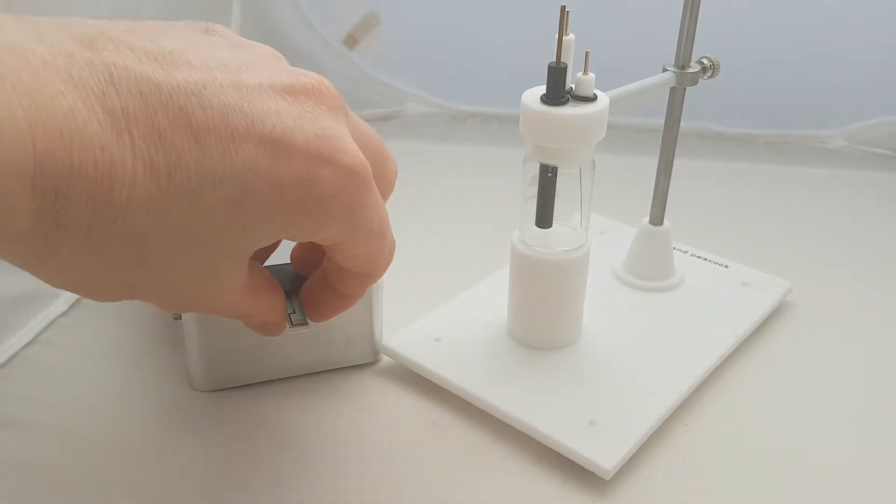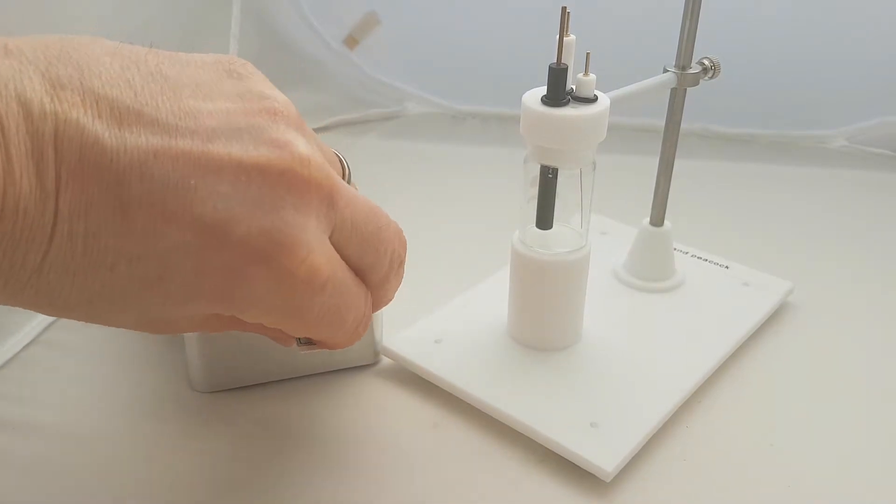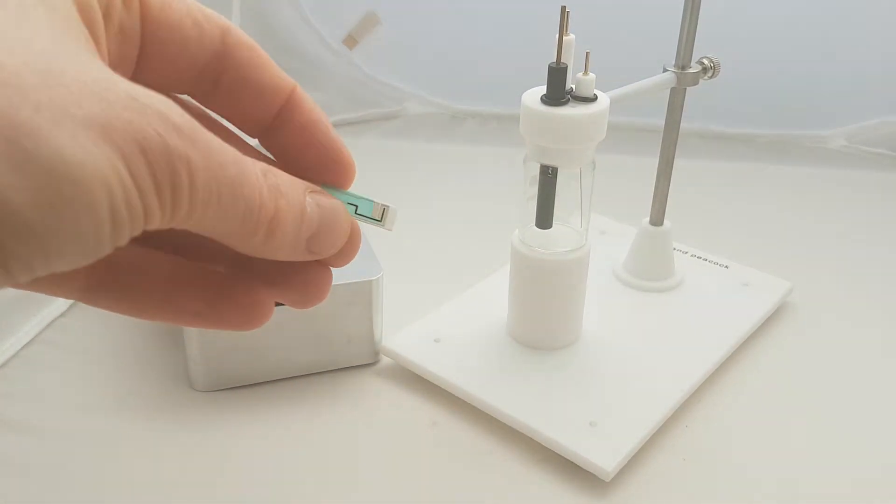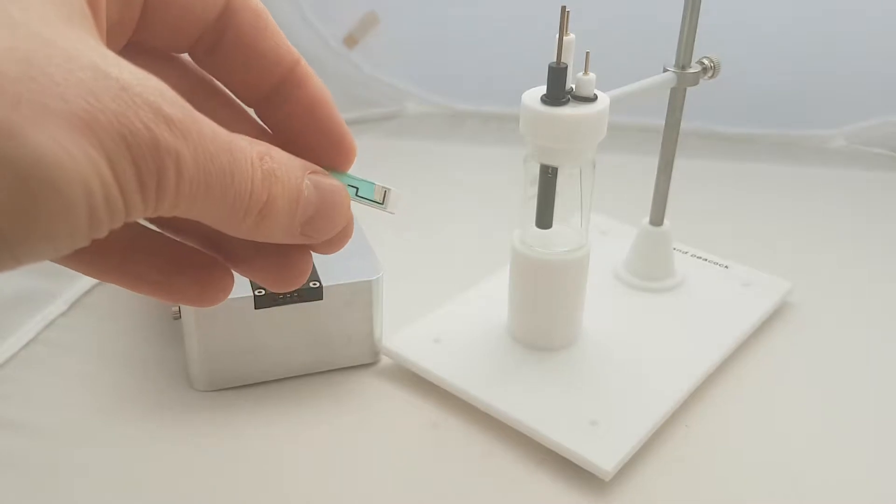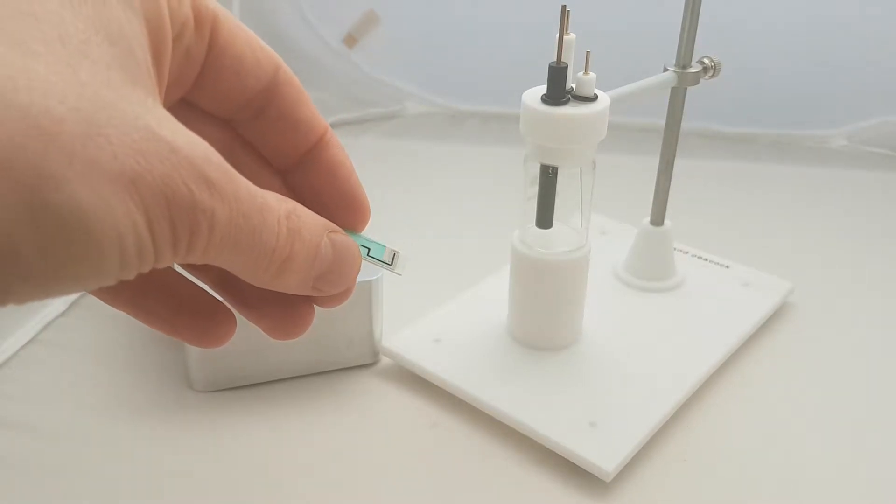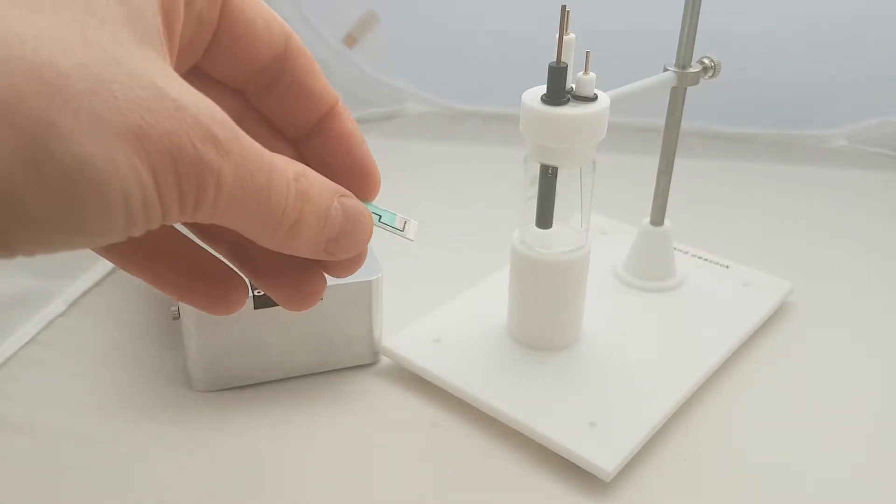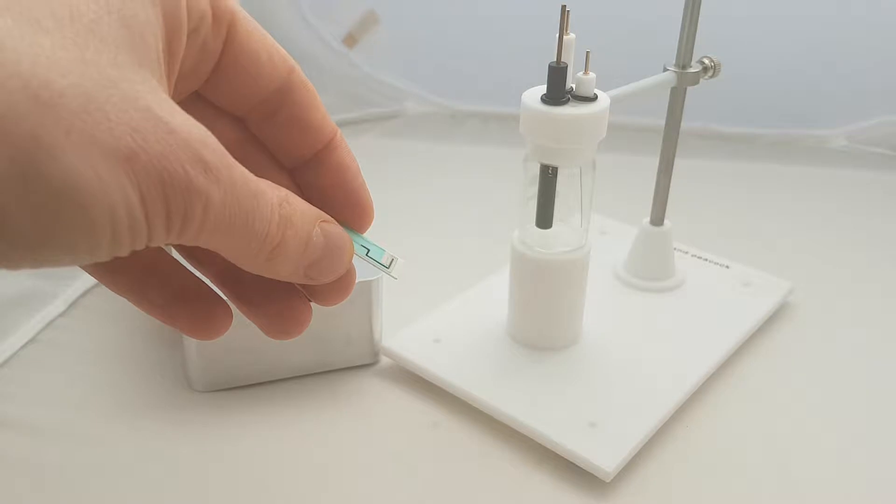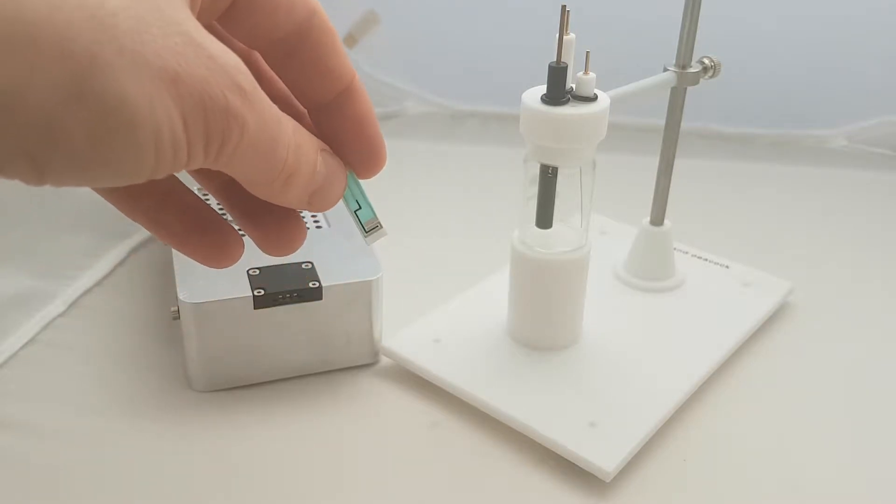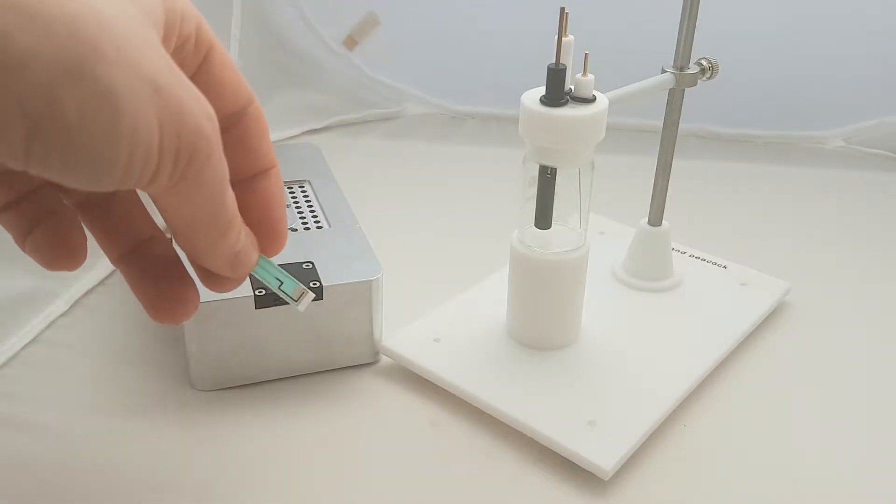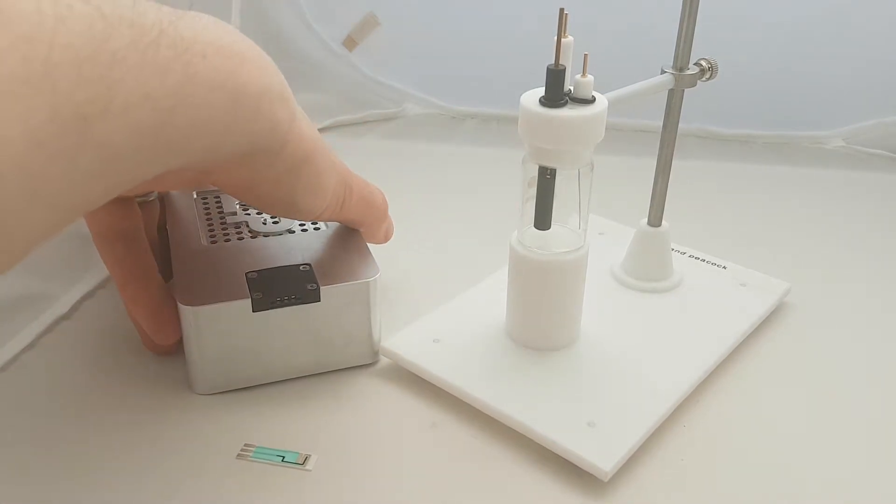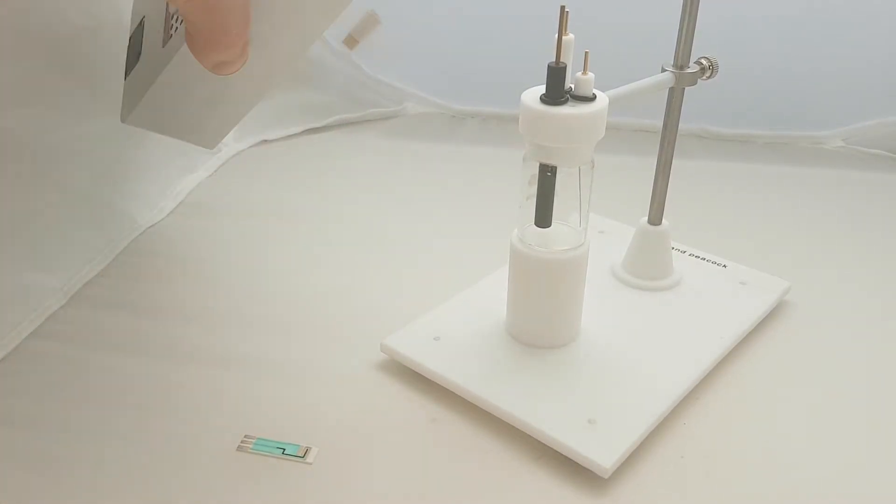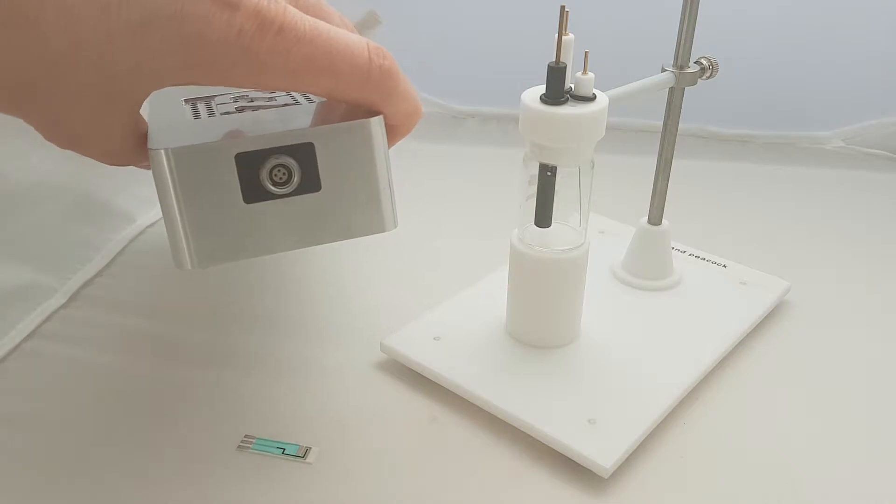A disposable electrode configuration something like this has a working electrode that happens to be carbon in this case, a reference electrode that happens to be silver silver chloride in this case, and there's also a counter electrode on there, so there's a three-electrode configuration. The nice thing about the anapot is there's also a connector on the back so you can actually run a cable out.